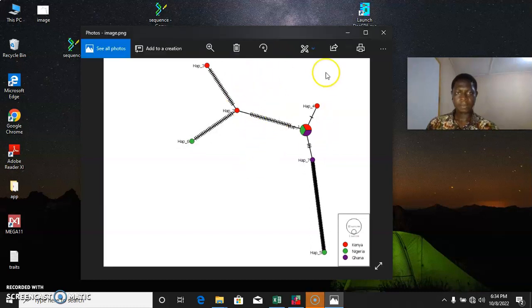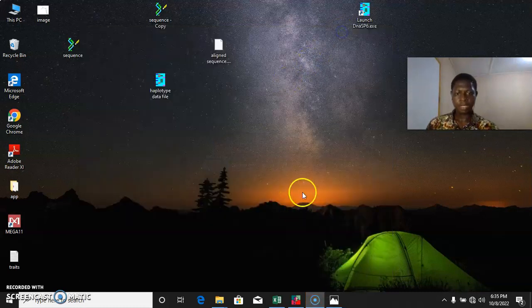And that's it. Largely, that is all about building a haplotype network.